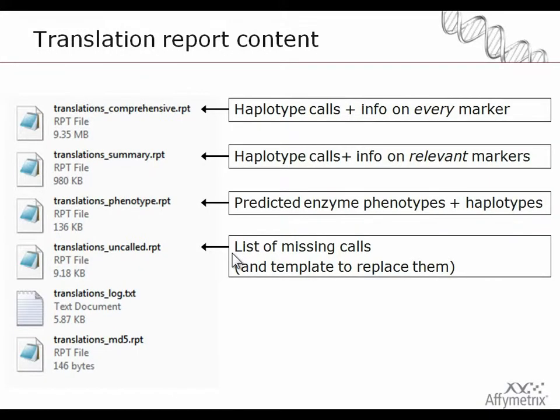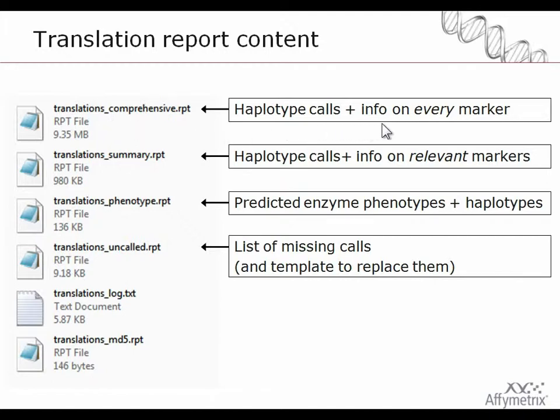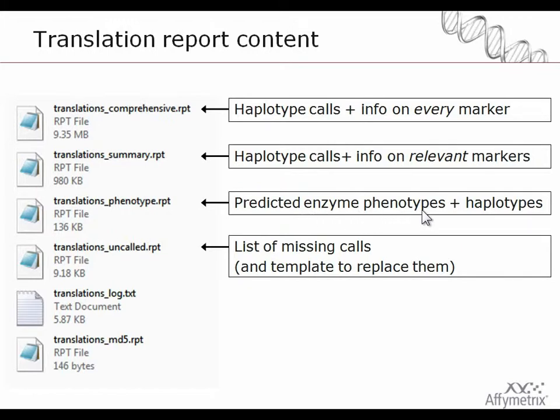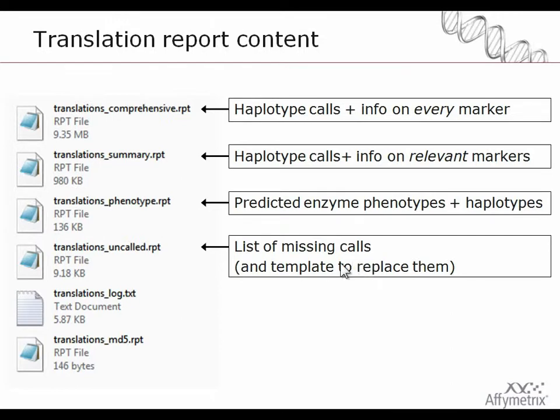Six files are generated. Four of them are reports on the data. Starting from the largest we have the comprehensive report, which stores the haplotype calls in addition to information needed to call the haplotypes on every single marker. The summary report is similar to the comprehensive report except that it only supplies the subset of markers for which there's relevant information. The phenotype report is the predicted enzyme phenotypes in addition to the underlying haplotypes used to call those. The uncalled report is basically a list of missing calls, no calls, possible rare alleles, and it can also be used as a template to replace those calls.